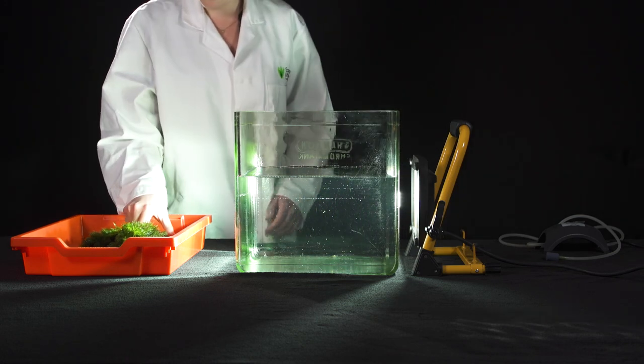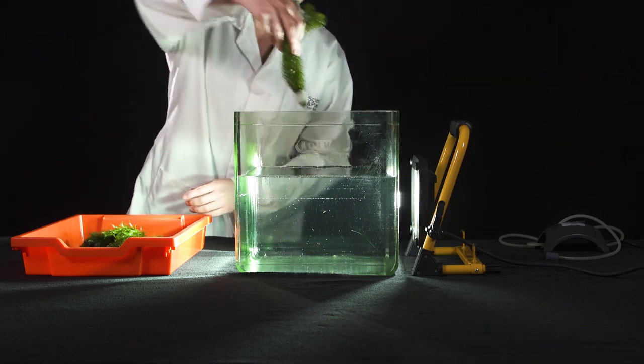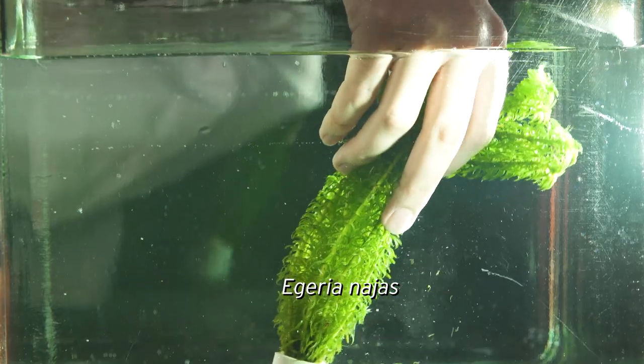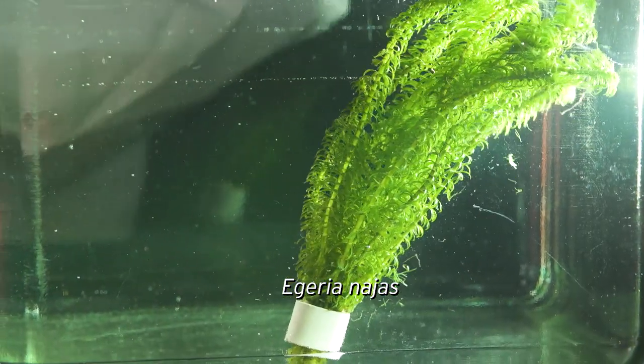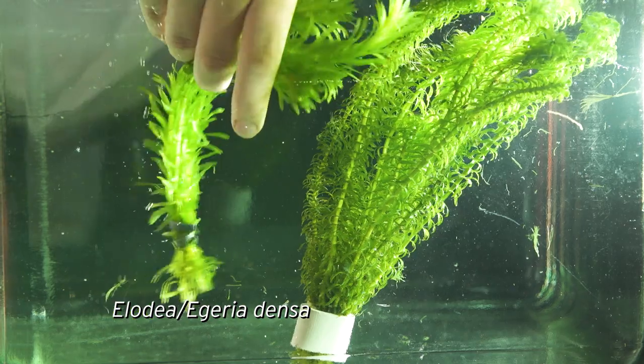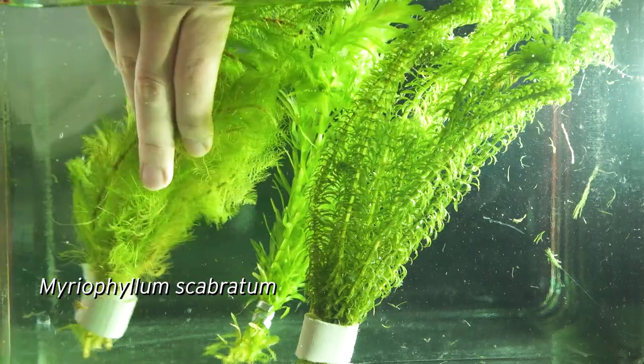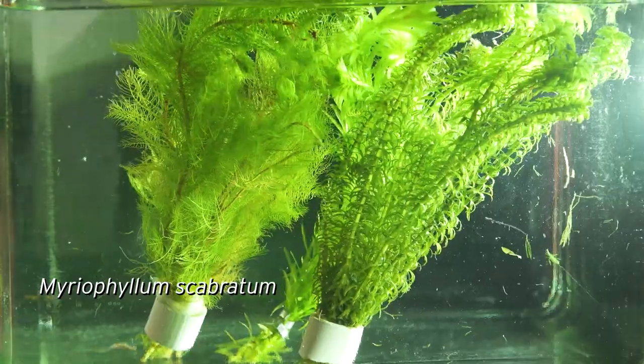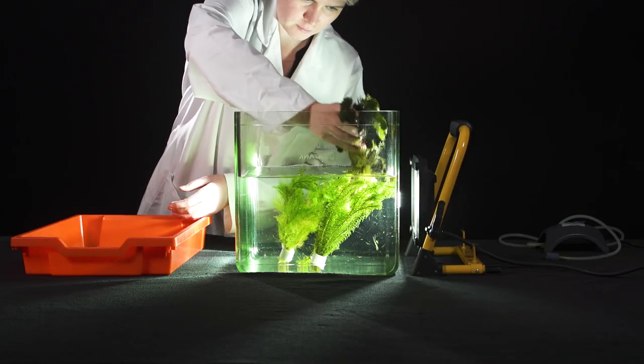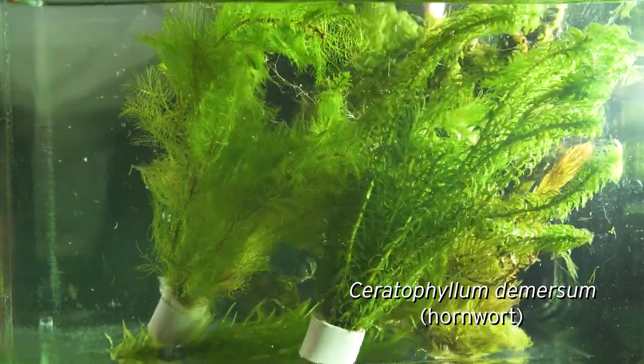Temperature is important when your pondweed first arrives in the lab as well. Many of the species we use are tropical, so plunging them into a tank of cold tap water will cold shock them. Tap water is fine to use, but allow the tank to come to at least room temperature, or even slightly warmer, before placing the pondweed into it. Also make sure that the tank is aerated.